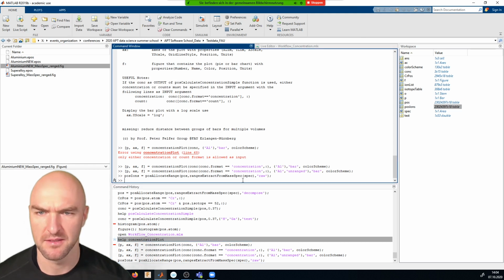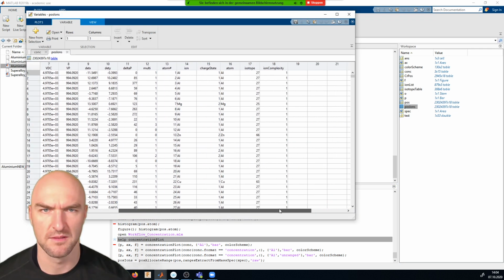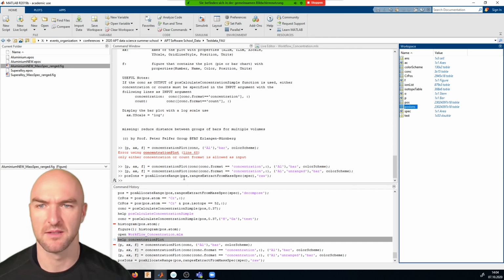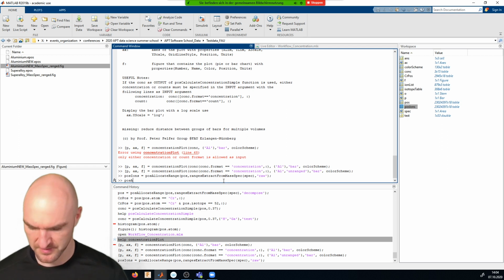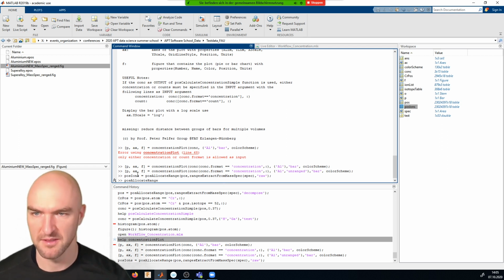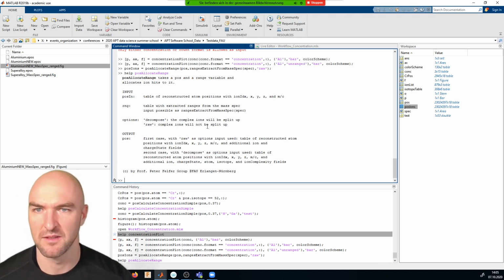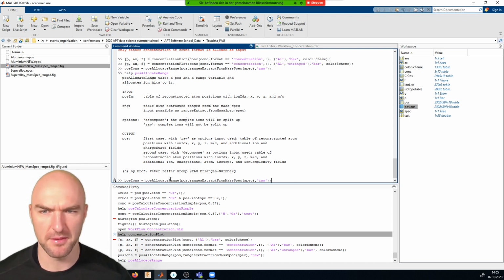It should not actually be decomposing the ions.